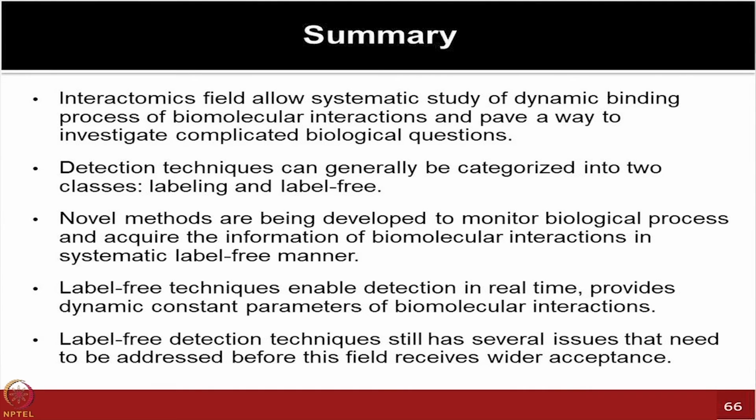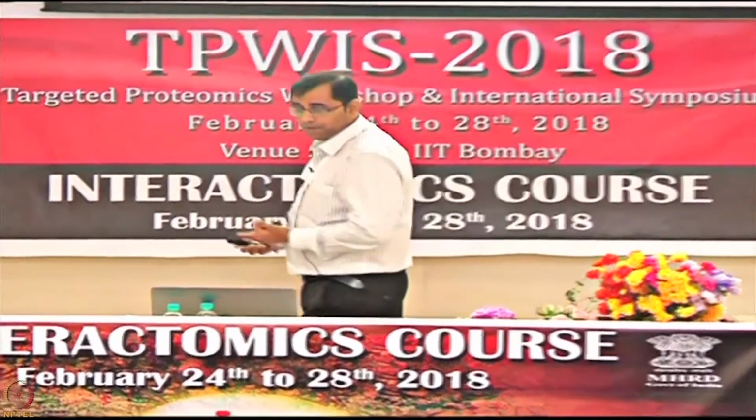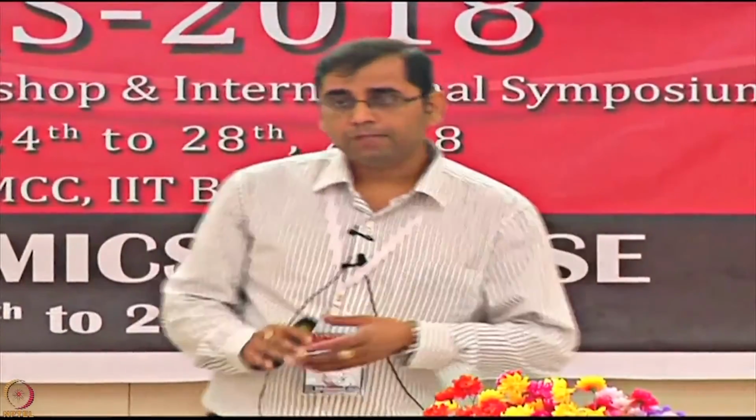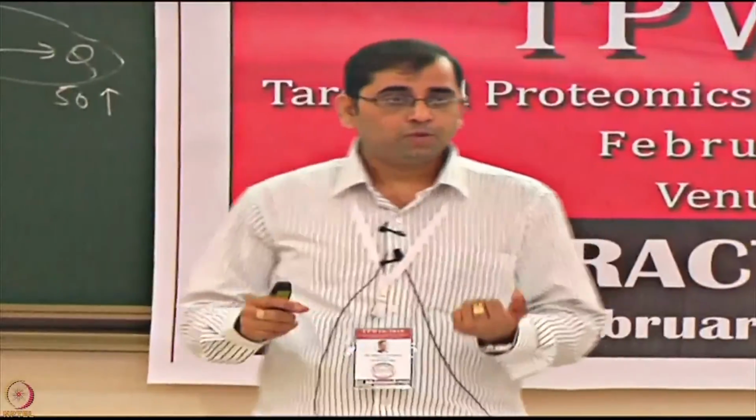All right. So in summary, I think I have given you a broad overview of the various interactomic fields, in which, to really understand dynamic molecules, you need a gamut of technologies. You cannot just rely on one that I have studied in this course and start using it for every application. You have to be very open to look for various types of platforms available to you. I'm sure overall you are convinced that there is a lot of potential in using these label-free technologies and the different platforms available, starting from conductance based principles, reflectance based principles, interference based principles. Many of those could be utilized. You can choose which platform is useful for your kind of application.